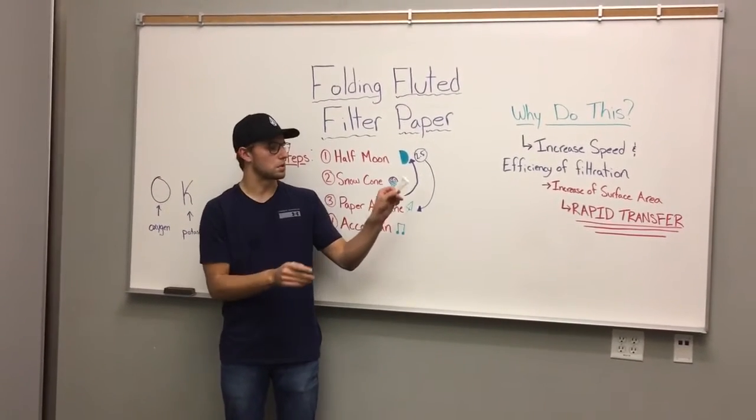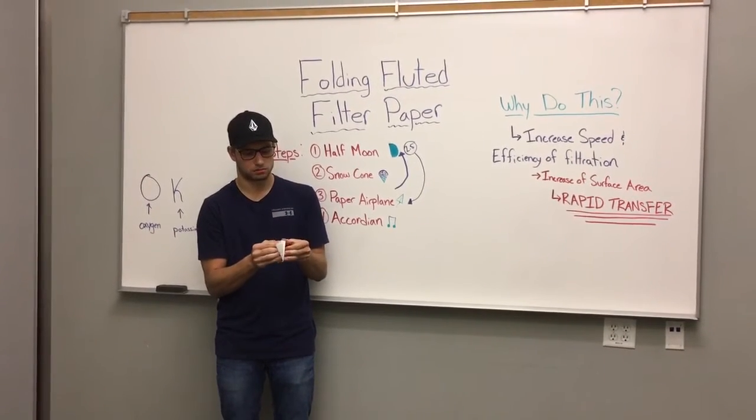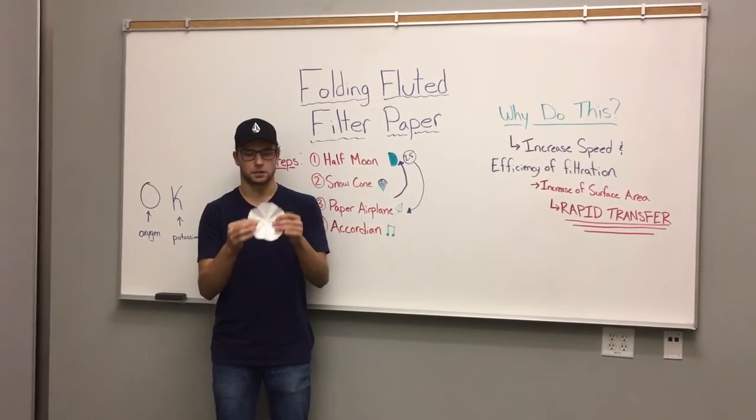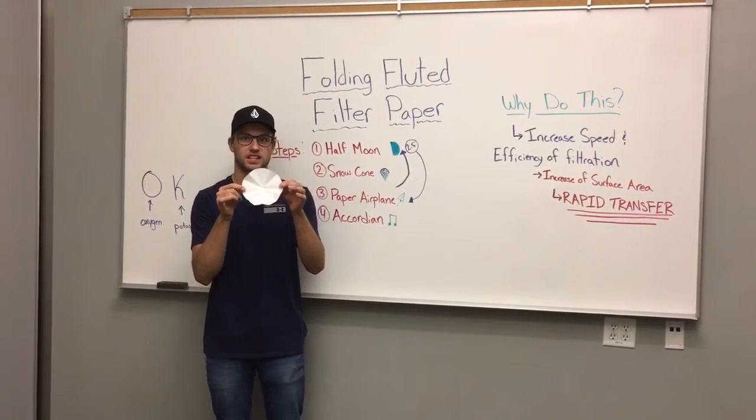Awesome, so it's gonna be pretty itty bitty. Unfold it — and here we go. Our beautiful fluted filter paper fold is done.